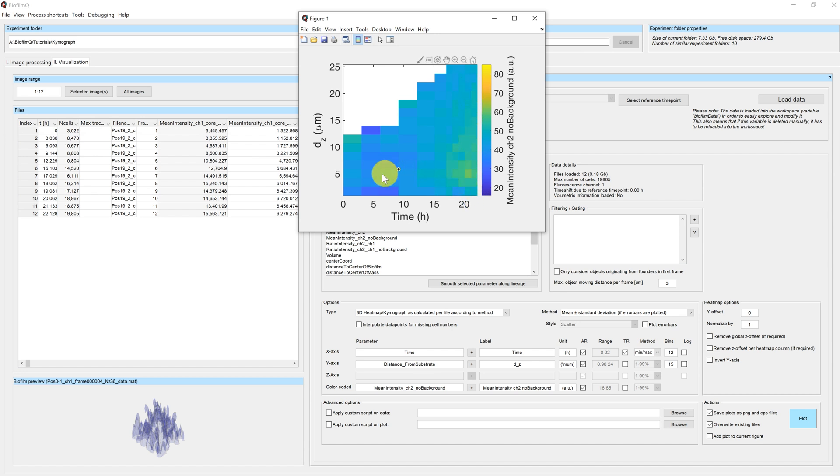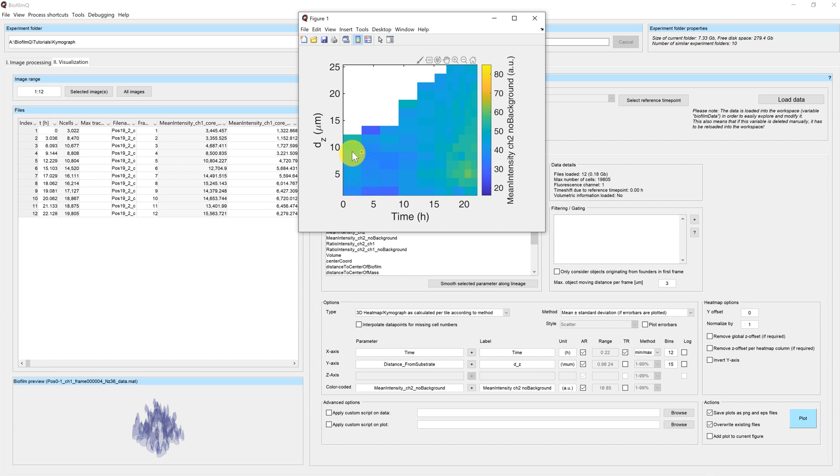Now each of these tiles represents the biofilm at one time point and one specific height. But that also means that we average over the biofilm height here. In some cases, you might want to look at additional spatial features.